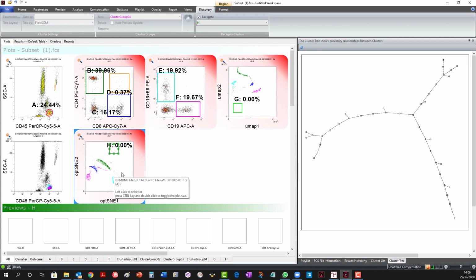So with these being the new way to visualize our data, it's vital that we also have a way of relating the clustered data back to what we know well, to actually improve our understanding of what we're looking at and where things should lie.